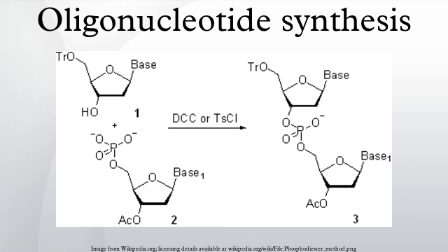Alternatively, 8 can be converted to phosphorothioate 10 or phosphoroselenoate 11, or oxidized by CCl4 in the presence of primary or secondary amines to phosphoramidate analogues 12. The method is very convenient in that various types of phosphate modifications may be introduced to the same oligonucleotide for modulation of its properties. Most often, H-phosphonate building blocks are protected at the 5'-hydroxy group and at the amino group of nucleic bases A, C, and G in the same manner as phosphoramidite building blocks. However, protection at the amino group is not mandatory.